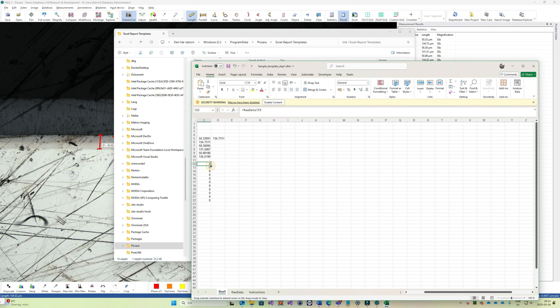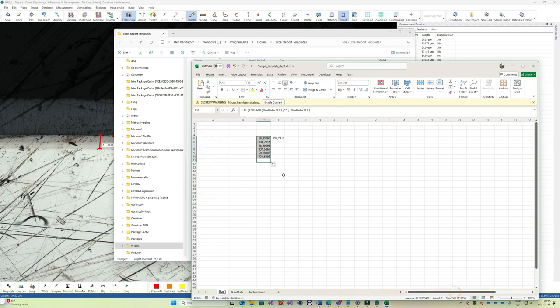Okay, of course I did it on the wrong spot, but now if I copy this cell to all the other positions, I need to copy it upwards as well, like this. You see, it will not actually copy or place zeros here, we'll put a blank here instead.